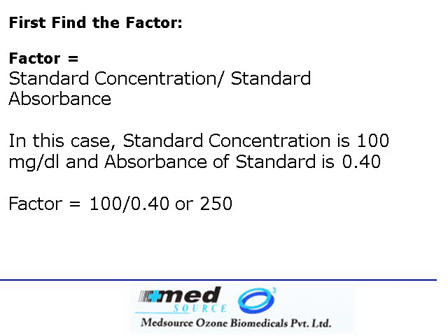Now, the most important measurement that we make for a biochemistry assay is the absorbance. Look at this diagram. On your left, you see a light source, which is typically a lamp or a halogen lamp. In the middle is where you will have your flow cell or cuvette, which will contain the liquid that is to be measured for absorbance. And on the right is your detector. Typically, the lamp will give light which will fall on the sample. If the sample has a dark color, then a lot of this light will be absorbed and a small amount will be transmitted to the detector.